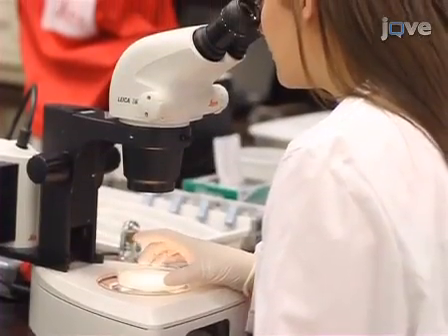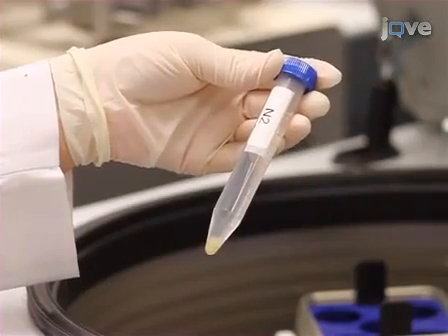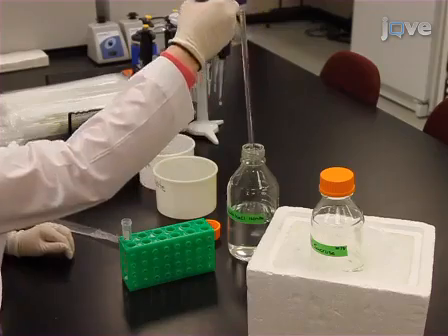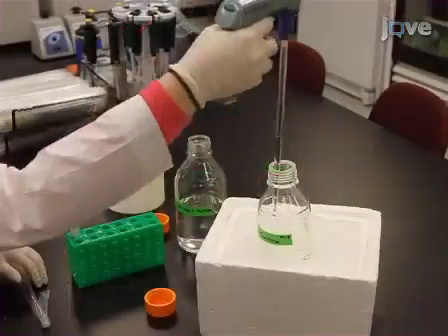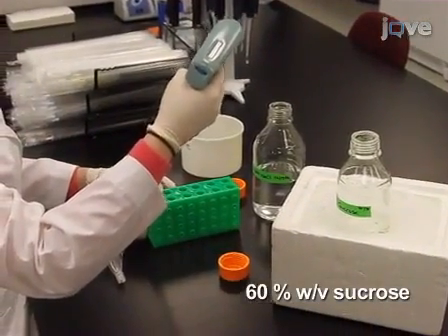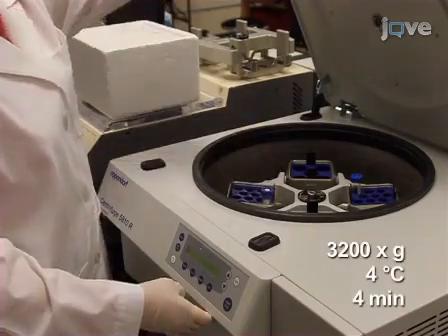Begin by collecting RNA from healthy synchronized nematodes. First, they are washed, resuspended in 15 milliliter tubes, and pelleted. Worm pellets are resuspended in 7 milliliters of 0.1 molar sodium chloride and 7 milliliters of ice-cold 60% weight per volume sucrose. After a 15-minute incubation on ice, the worms are pelleted again.